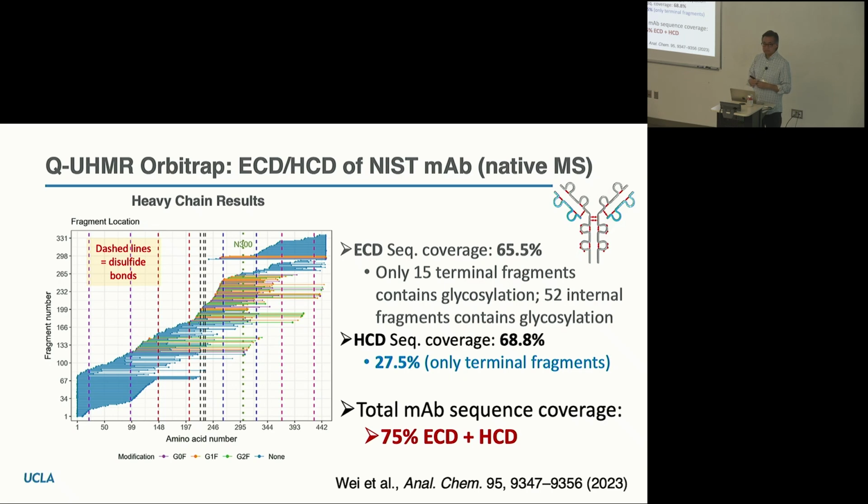I have a question on this one. What's the goal for you and Amgen on this? Is it to know they made the right sequence, or is it to map oxidations and deamidations, or all of that? Well, the latter one.